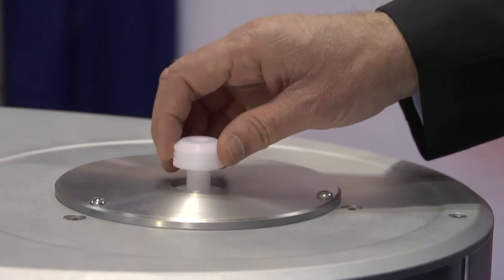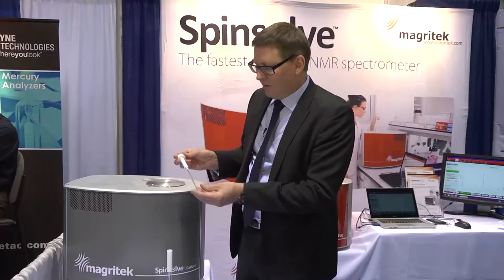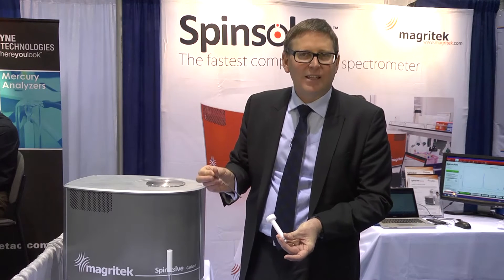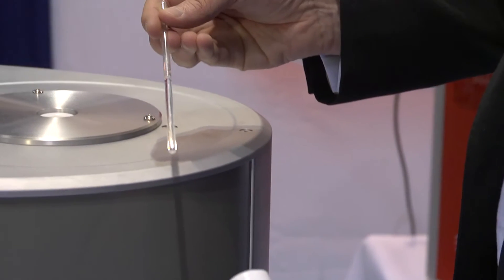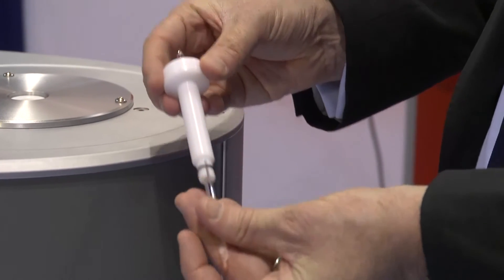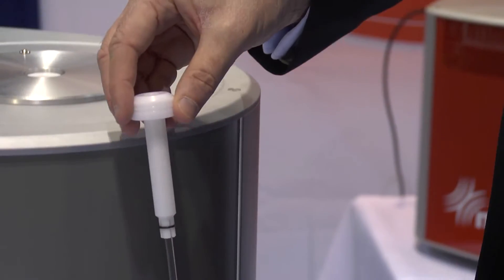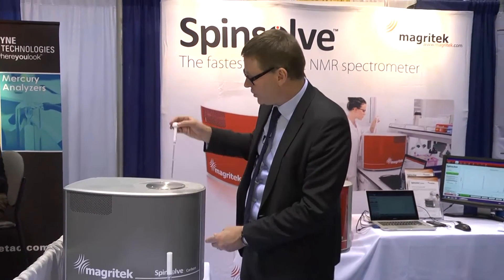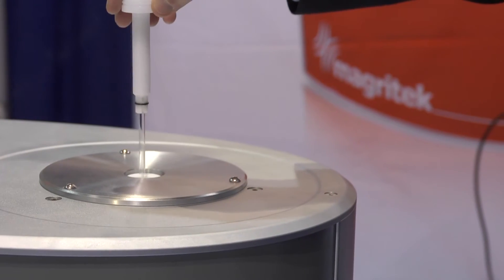For normal use, the sample is placed inside a regular 5-millimetre NMR tube, exactly the same way we do NMR at high field. There's a liquid sample dissolved in a solvent. The sample is placed here, and we check it has the correct height with this depth gauge here, and place the sample in the magnetic field.